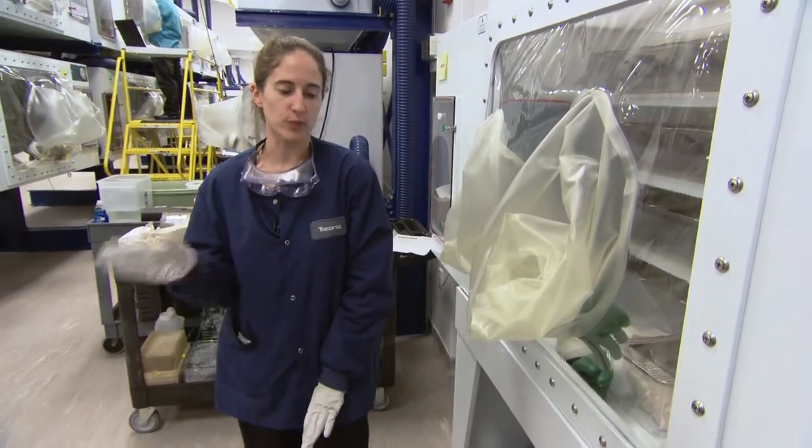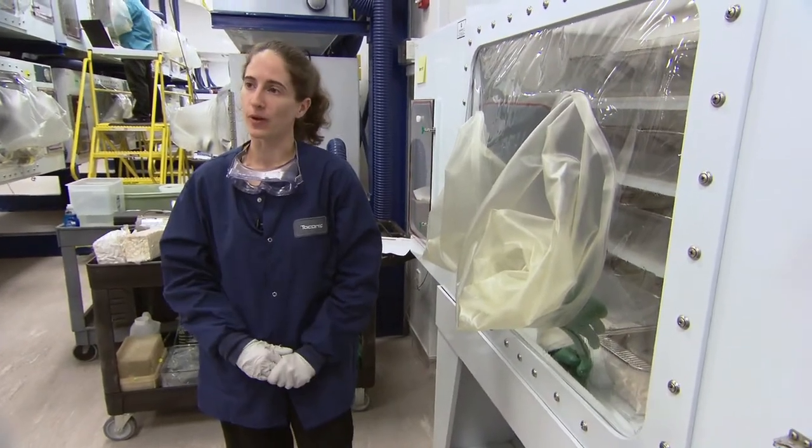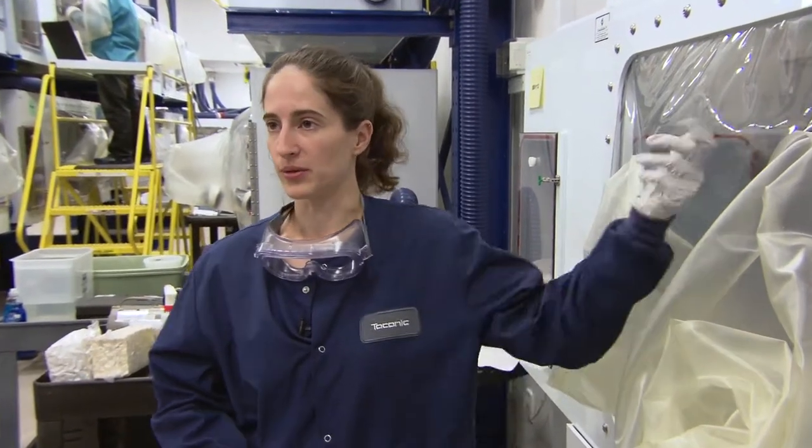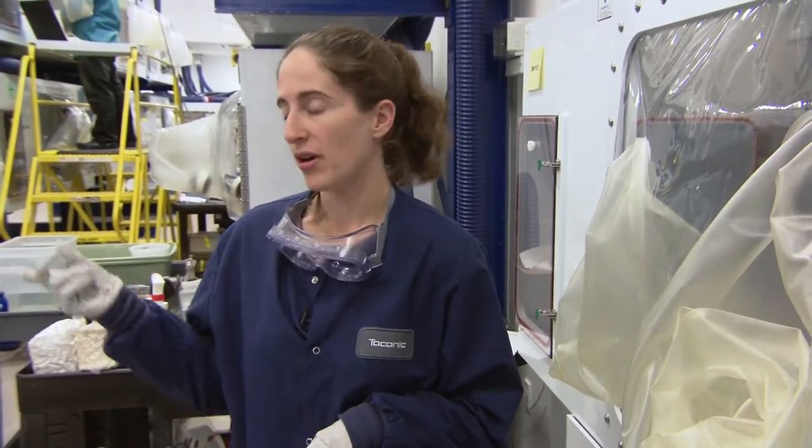In the germ-free isolator, I believe they're just using water, so they'll just go around and carefully inspect the isolator for holes as opposed to spraying it. Have you thought of some sort of leak test with the gloves, such as submerging it in water to see — pushing air — and then if there's any bubbles, you'll see a leak?